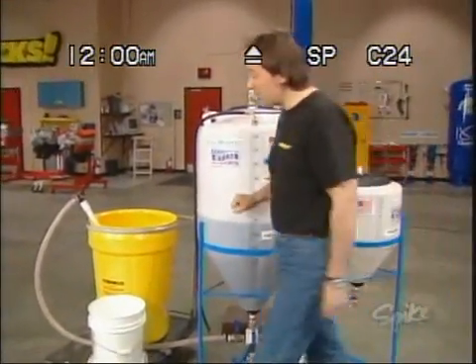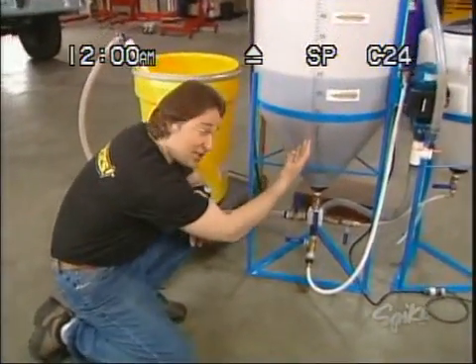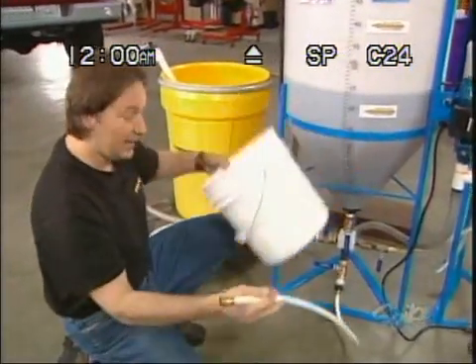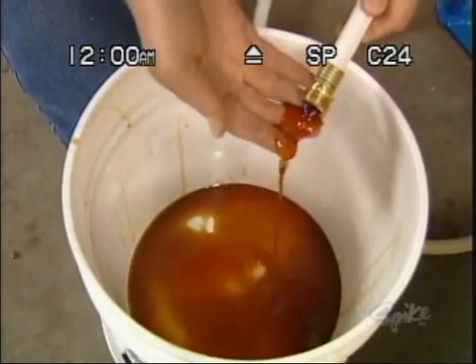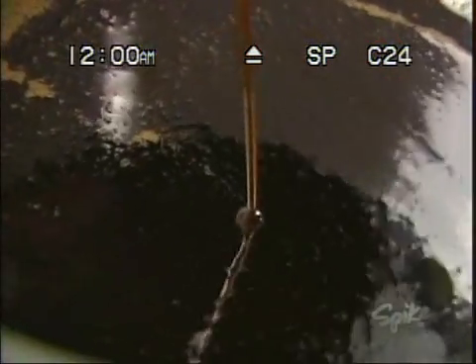All right, once everything is properly mixed, you just let it sit for a few hours. That allows all the glycerin to settle to the bottom. Obviously, you don't want that in your fuel, so all you have to do is drain it out. Notice how dark and thick and gooey the glycerin is.